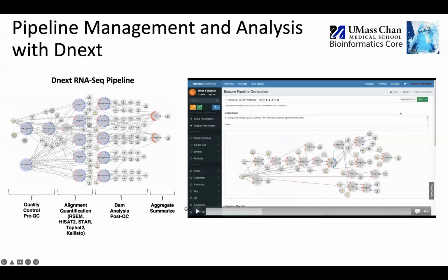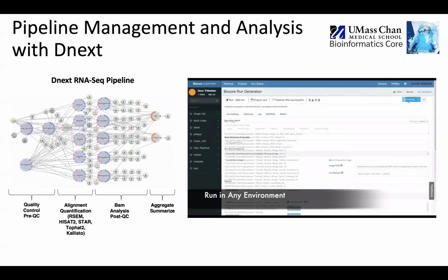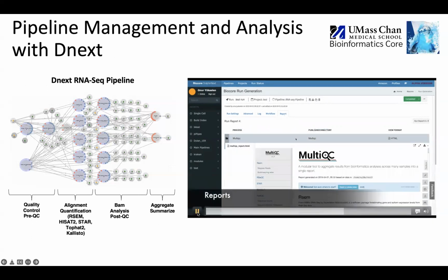You can just basically press this run button here on top, and you come to this run page, which I'm going to show you in detail, by the way. Basically, you choose your single end or paired end, or you choose your genome build here, human, mouse, whatever. You fill in this form and then press the run button, and it's not going to be this fast, but basically it's going to be completed like this. Hopefully, in this workshop today you're going to start your own run in Dolphin Next. Basically you're going to run everything here for RNA-seq and you're going to get all these results.